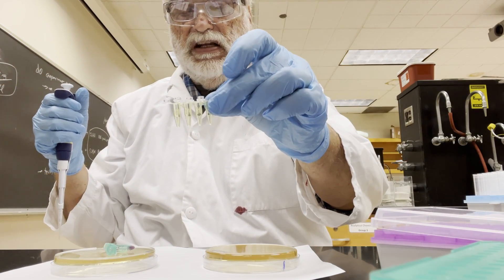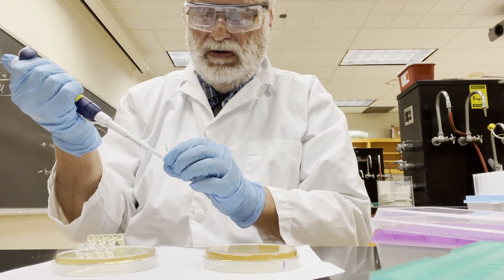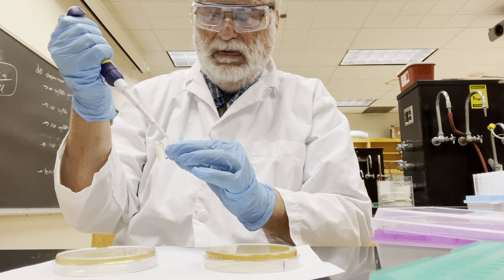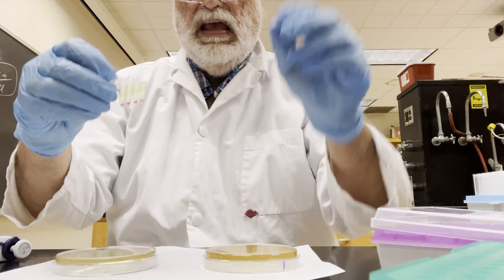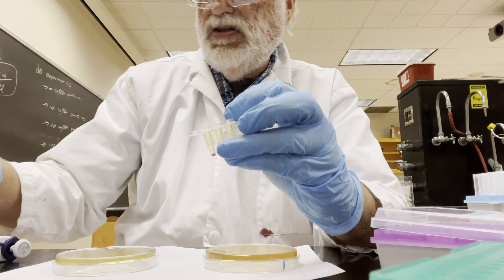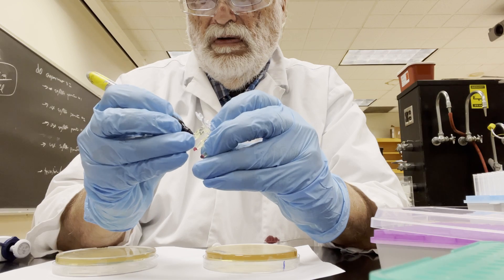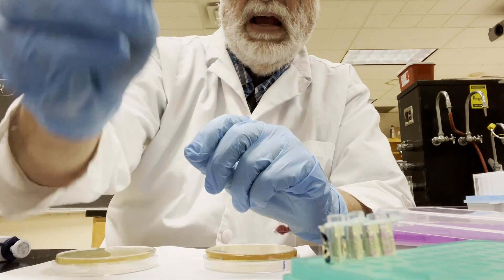I have a set of labeled PCR tubes right here, and I will add 10 microliters to each one of them. Now I have four samples — we ask you to take four colonies, so I have four solutions labeled 1, 2, 3, and 4, with the sample ID. Now that I have the PCR solution set up, I'll put that on the rack right here in front of you.